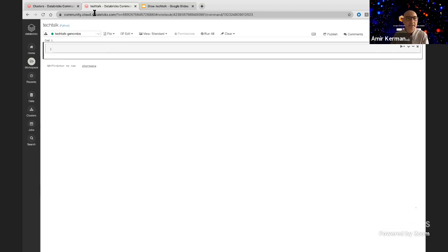By the way, I'm running this on the community edition of Databricks. Keep in mind, you don't have to run Glow on Databricks. It's open source, and the documentation is actually geared toward having your own installation. But for ease of use, I'm using Databricks, and this community edition is accessible to you, free. So you can just sign up and start playing around.